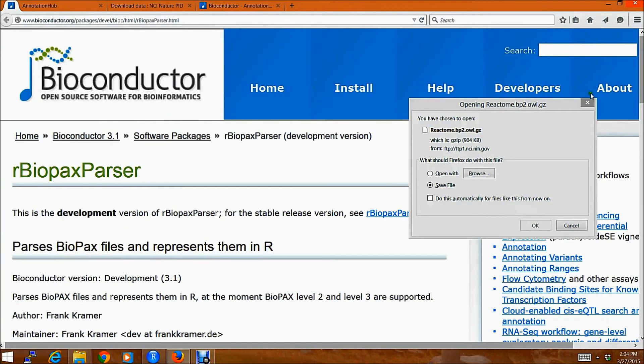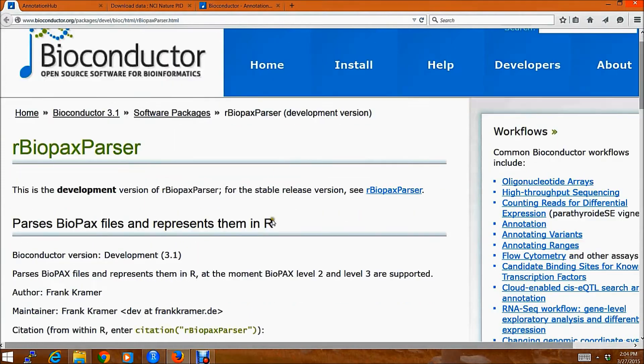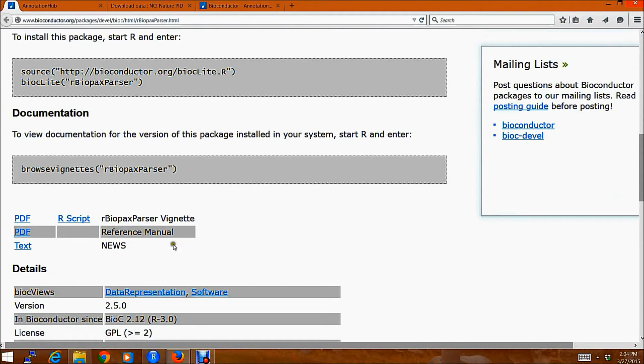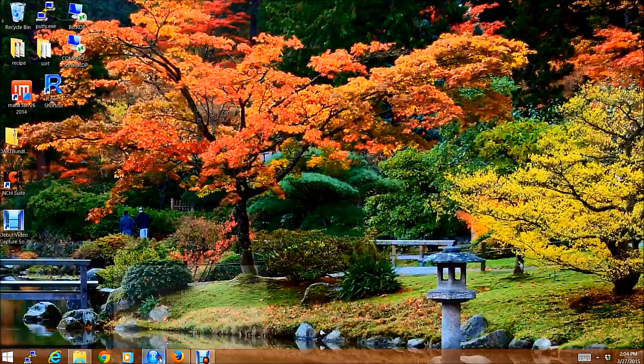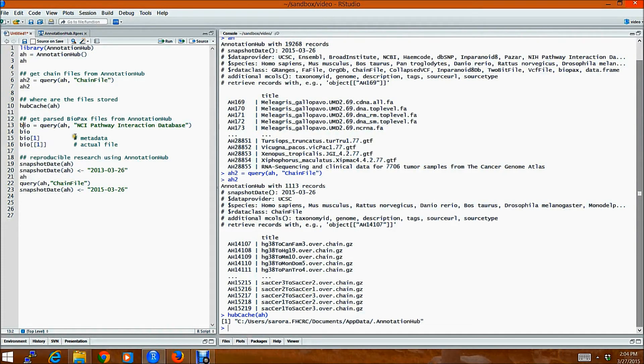one would have to download these files. And then using a Bioconductor package, Biopax parser, one would have to parse these files. These files take about anywhere between 5 to 10 minutes to parse.